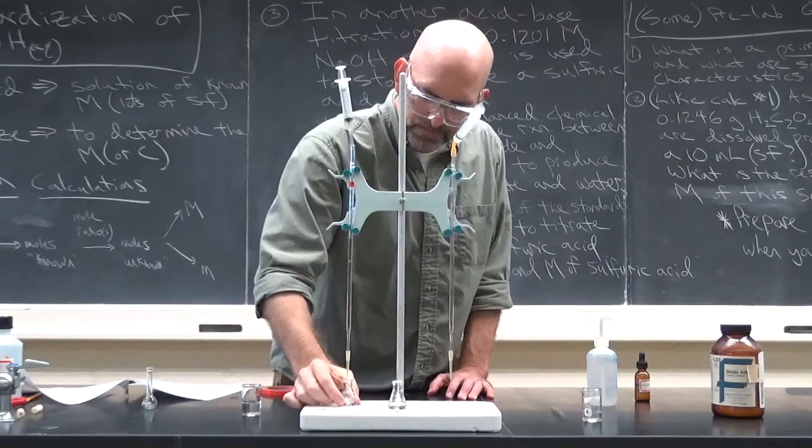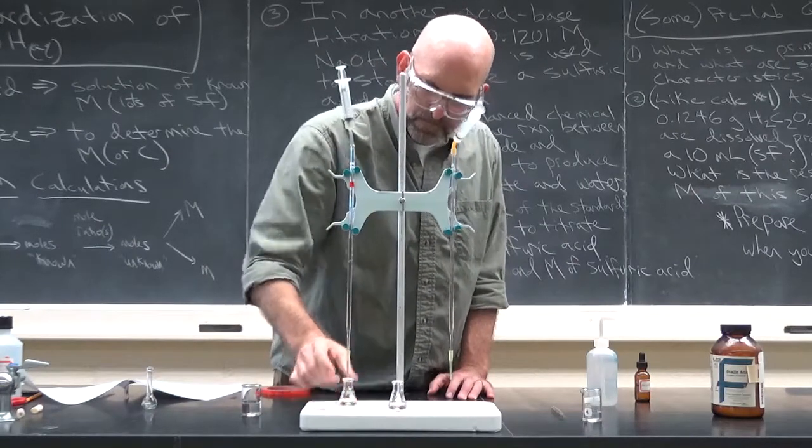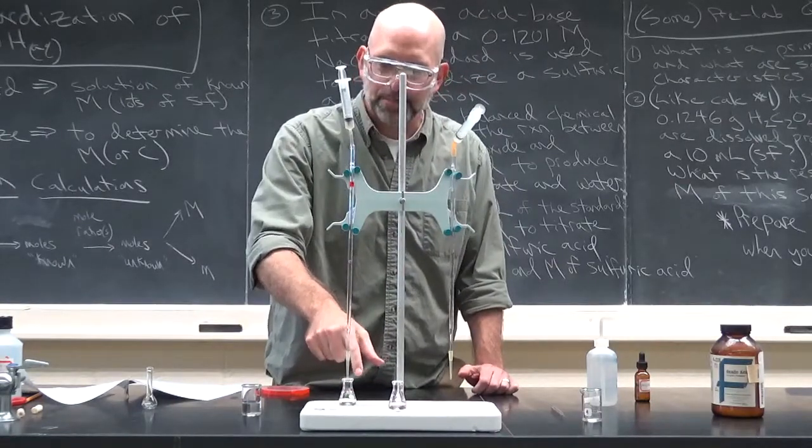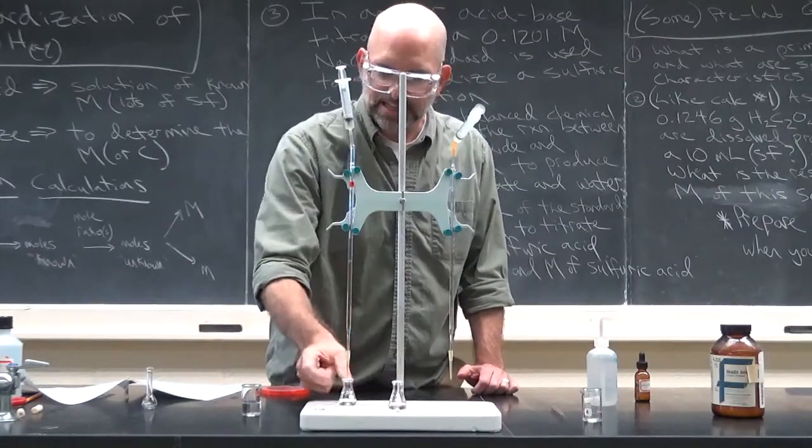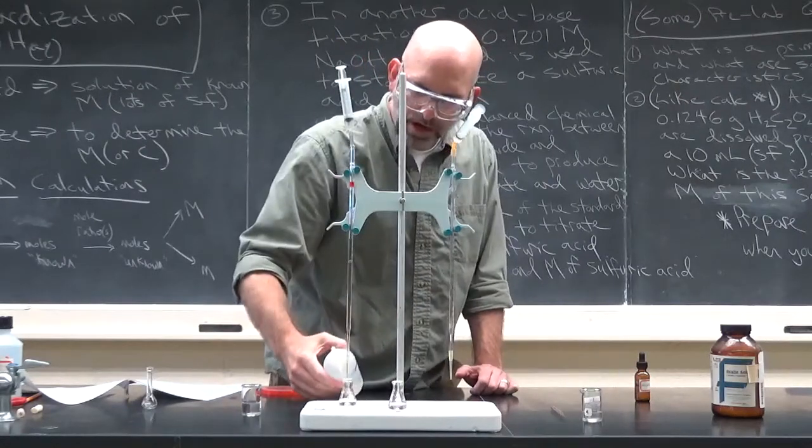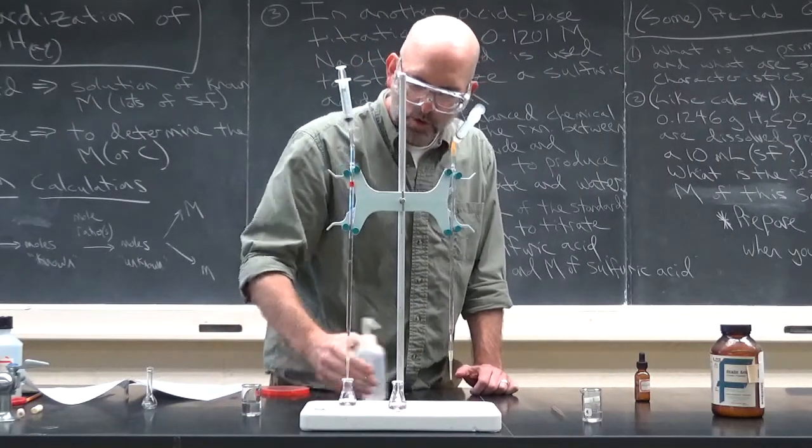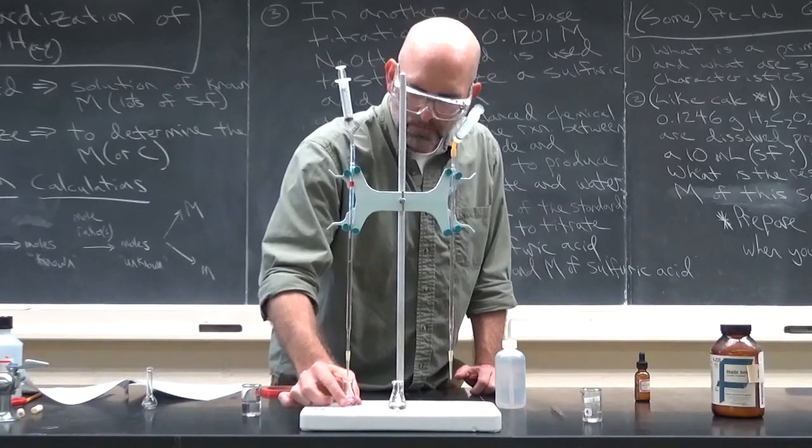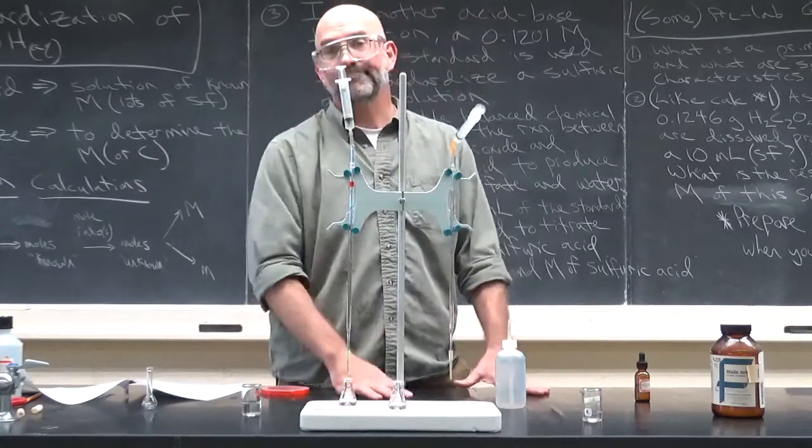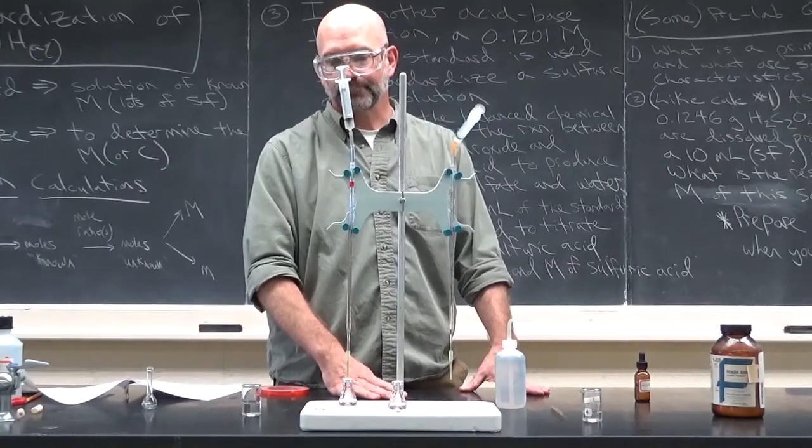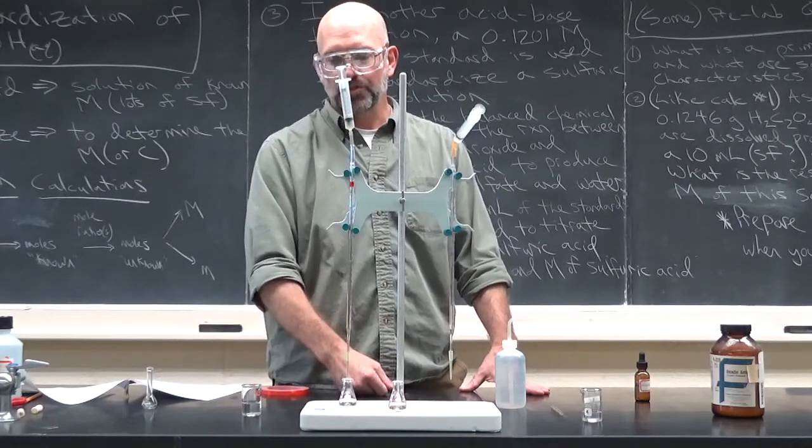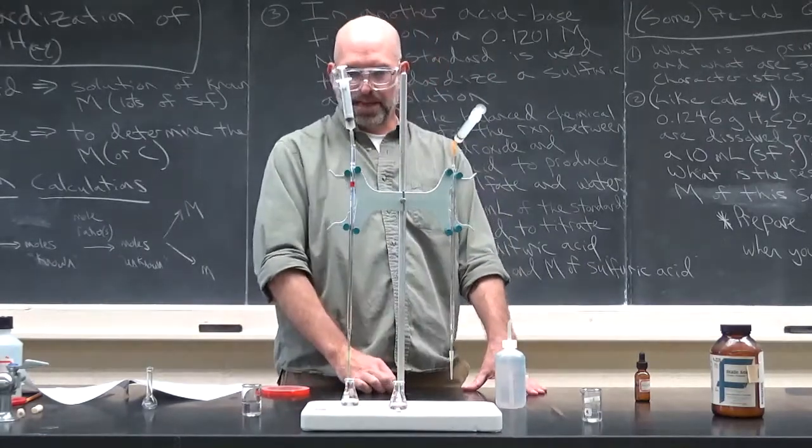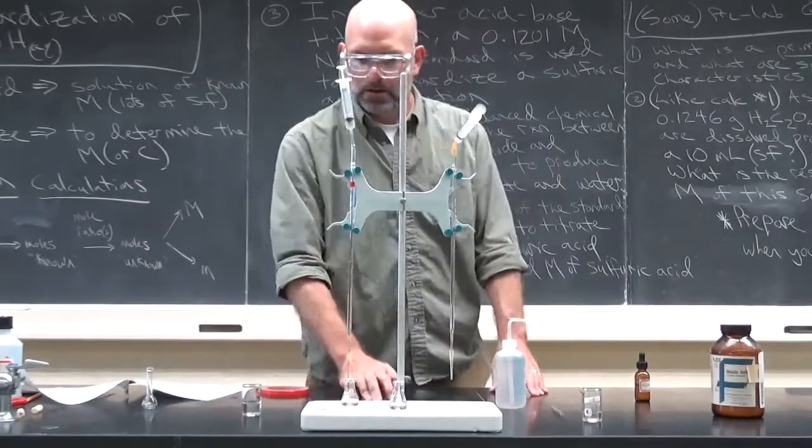A couple more drops. Swirl it gently. If you notice droplets hanging off the burette tip and they get stuck on the inside of the Erlenmeyer flask, a little bit of water, you can squirt it down in there. Oh, and I actually probably over-titrated again. I made another mistake. That's pretty close. But I think, well, no, actually, maybe that's okay.